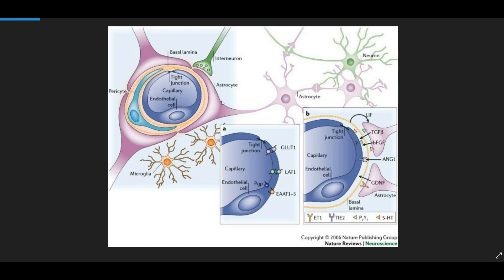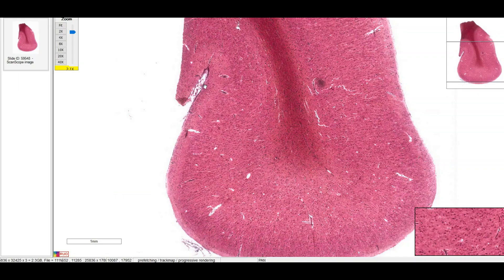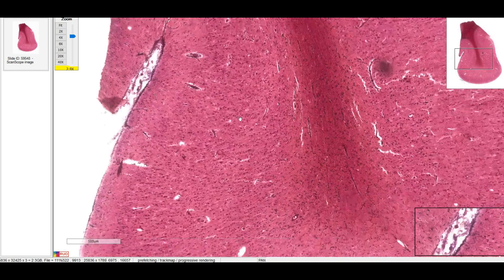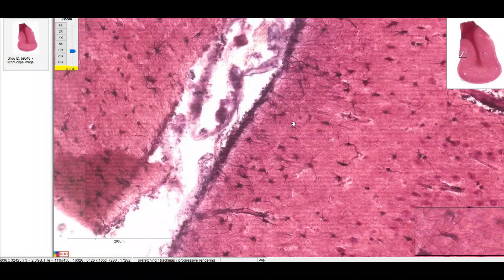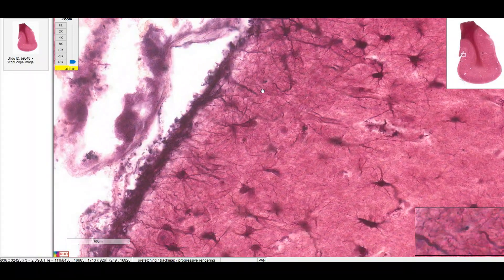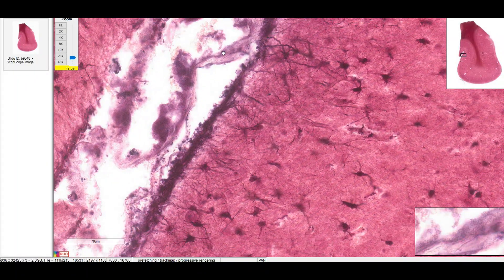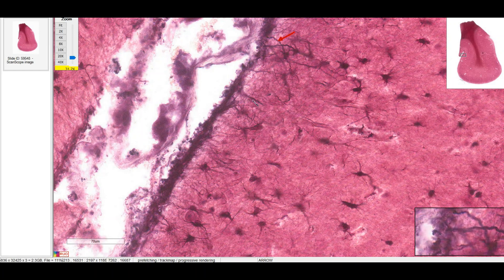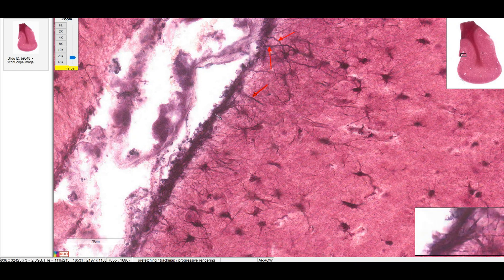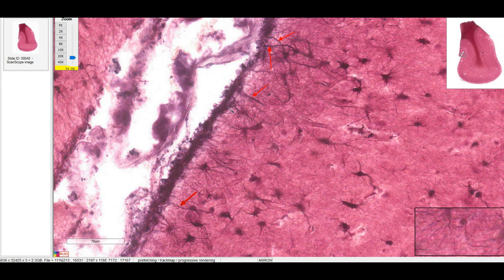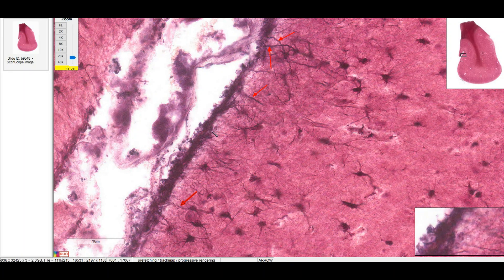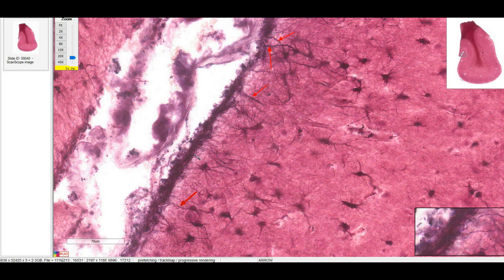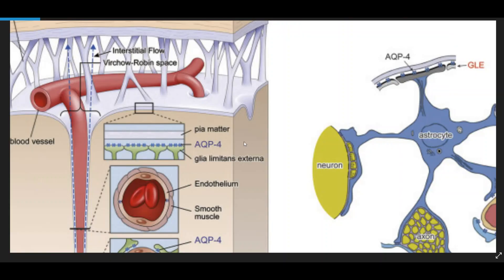But there's also an external glialimitans. So let's take a look at that now. Let's zoom in to where we can find some pia mater. You can see here how there are astrocyte processes that are extending towards the pia mater over here. It's going to form this layer called the external glialimitans just deep to the pia mater. And here's a schematic from a Nature article on what that relationship between the external glialimitans and the pia mater looks like.